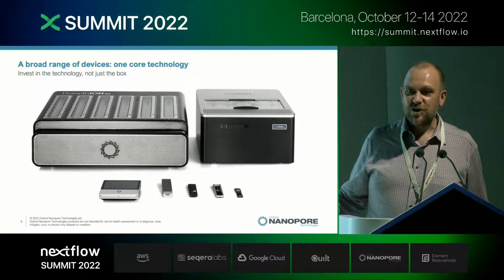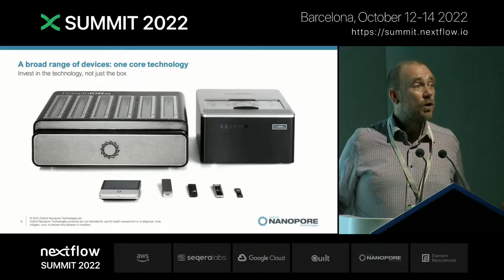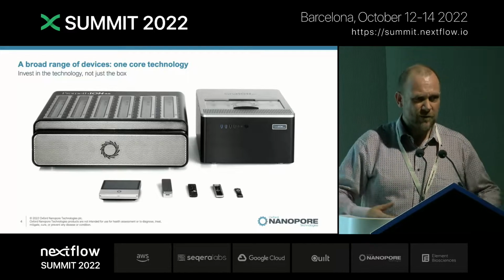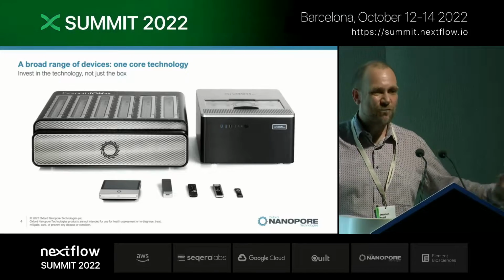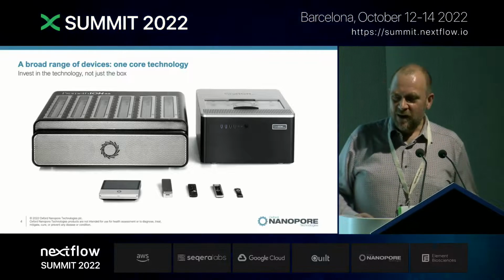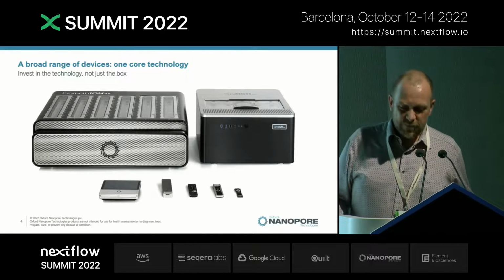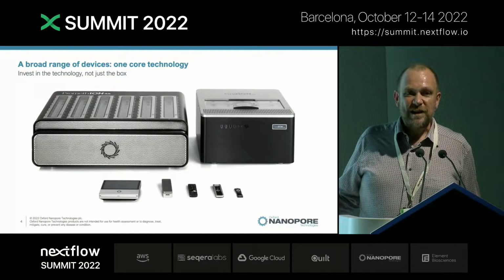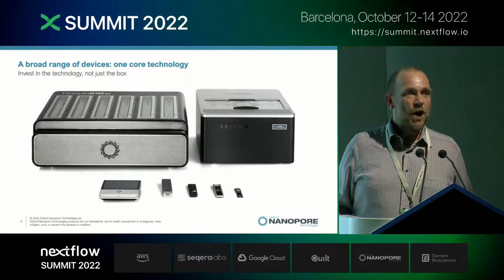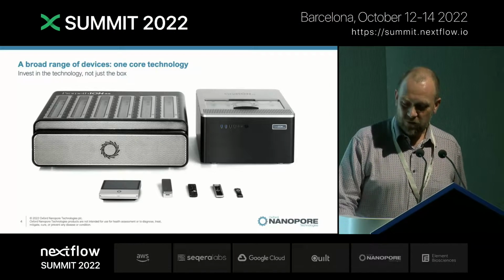We have a number of shiny machines that enable the sequencing of DNA. They range from the small, the MinION, smaller than a cell phone, to things the size of, how big's a PromethION? I'm not quite sure the metaphor I meant to use to describe it. Anyhow, it's the size of a small microwave, a compact microwave, a flattened microwave. Anyhow, these machines give an ability to sequence at very different depths of information. And particularly the smaller machines enable a democratized sequencing where you can take the device out into the field. You can take your DNA sequencer to your biological sample rather than bringing the sample to your sequencer.